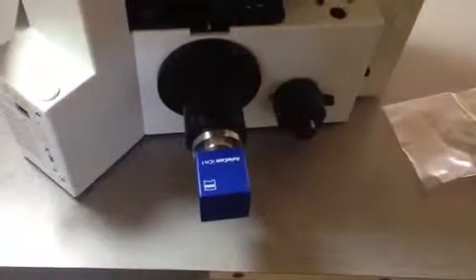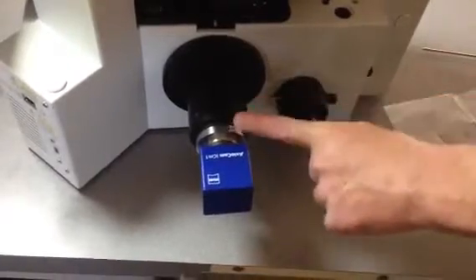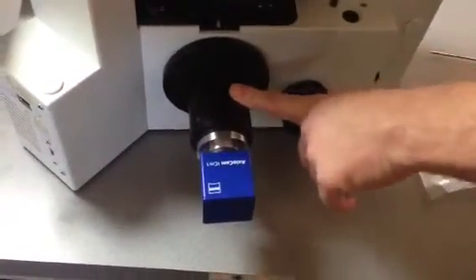This is a procedure for changing the camera mount on your iX microscope. This is how your mount should look right now — you've got your camera attached to it with this coupler.